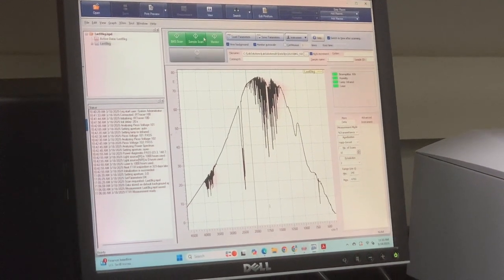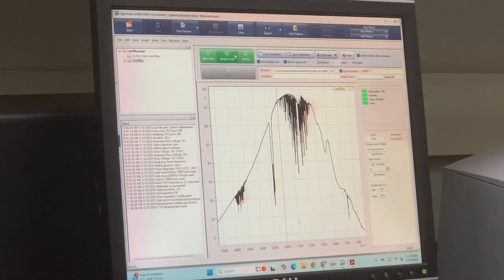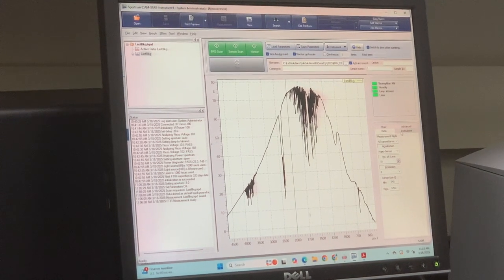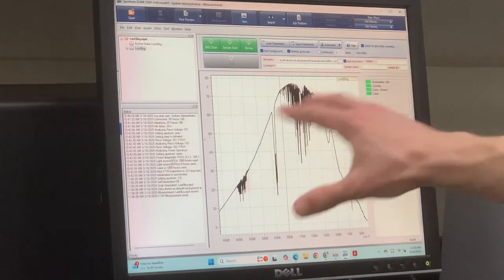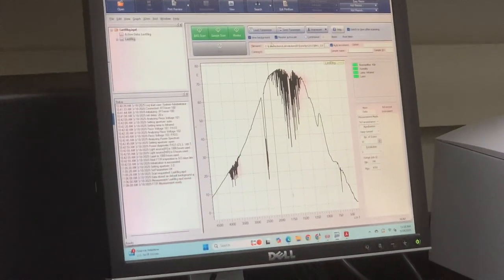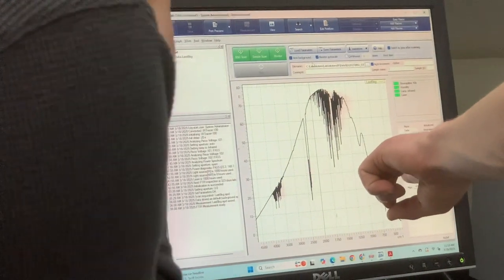So if you have the integrating sphere and you're heating it through a certain ramp, you can observe that chemical reaction. Makes sense. If it's monitoring, it's just going to be looking at it, and you could take a scan at any time, like taking a screenshot. Yeah, it'll save it, and we have control of how much time, that's the number of scans and resolution.